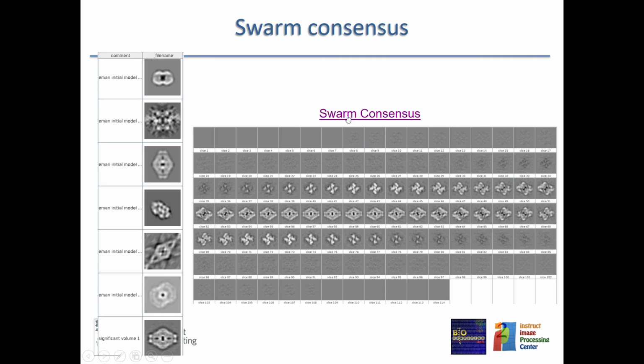There is a very nice video here where we can see this swarm optimization. So let's say that we want to minimize this function. This function has only two parameters, and there are two local minima. One is deeper than the other. Okay, so then we will start with a random swarm. So we have many different possible solutions. Each one is a candidate. So in our setup of CryoEM, each one of these points would be a volume.